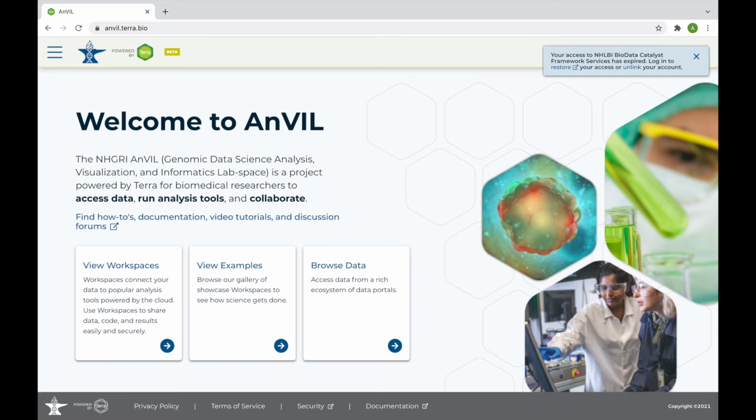We can start at the Terra homepage, and the link for it is included in the video description box below. Terra has integrated with Galaxy, making it possible for users to spin up a custom Galaxy server backed by a cloud environment and dedicated resources. Apart from providing a rapid and customizable cloud Galaxy instance, Terra is able to access a rich data corpus hosted in the cloud, including many controlled access datasets, facilitating the user to securely carry out analysis using this data.